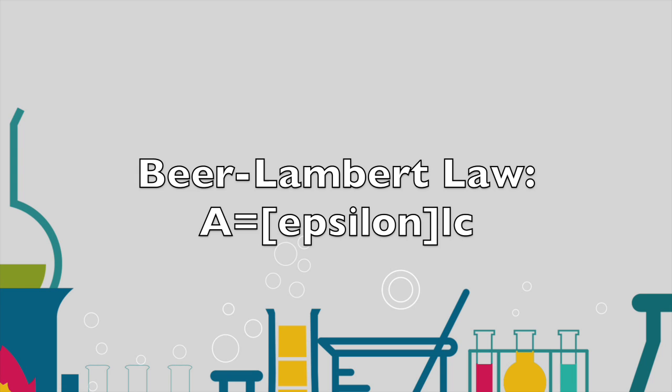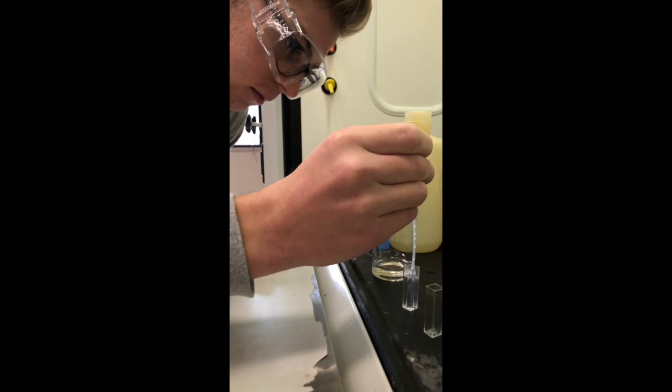Absorbance and concentration are directly proportional, so typically the higher the concentration of a solution, the higher the absorbance that solution will have. Failing to zero a spectrophotometer before using it could alter the results of your data.